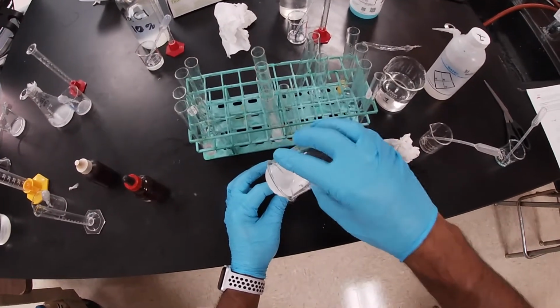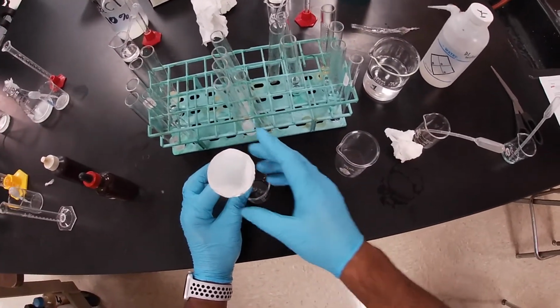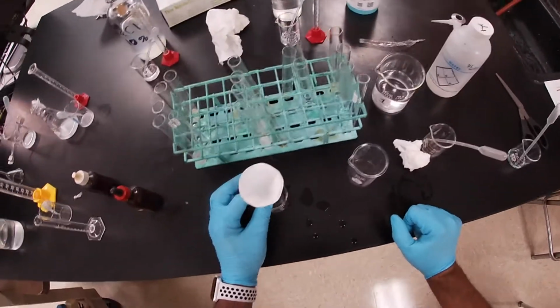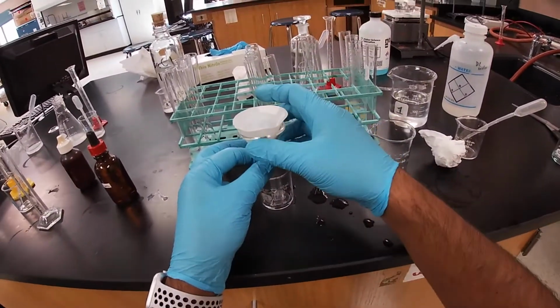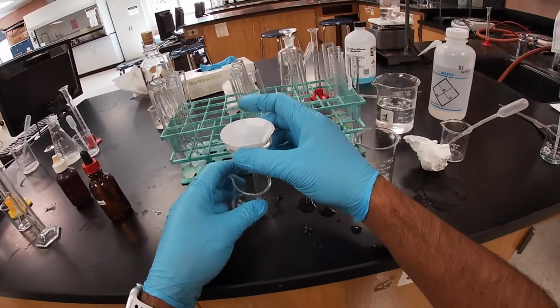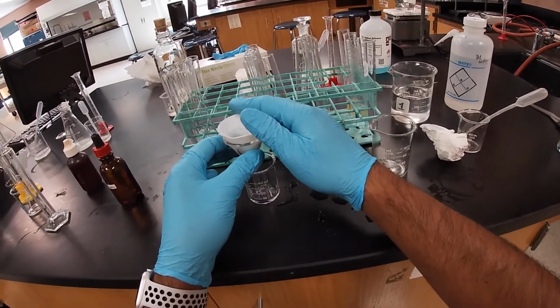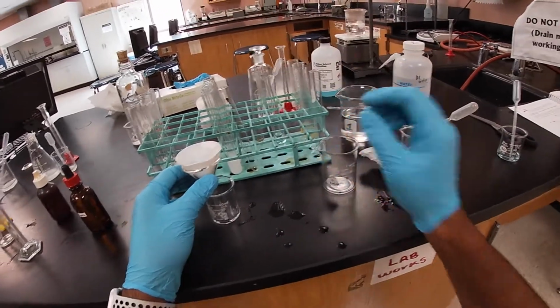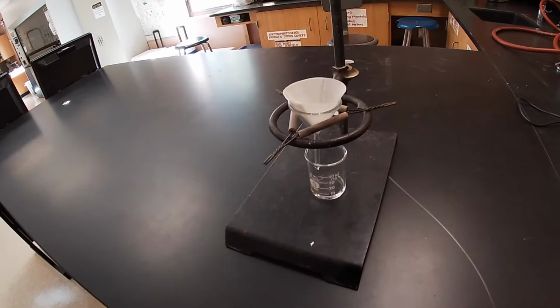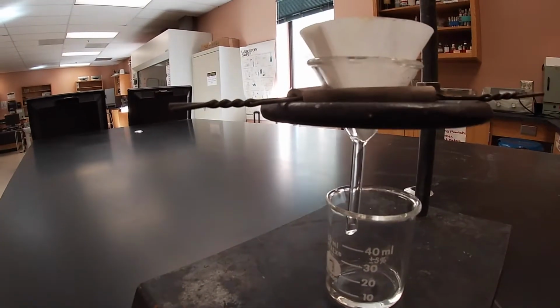We're going to put our substance through the filter and let it filter out and sit for a while, and then once it filters out, we're going to test the contents of whatever's left over. Okay, as a small little setup just so that I don't have to hold the filter.